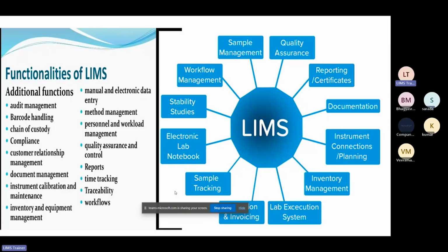Suppose there is integration, like a balance connected with the LIMS software. Then there will be no manual entry. Whatever weight comes on the balance will be automatically recorded into the LIMS software. So the manual entries are removed.